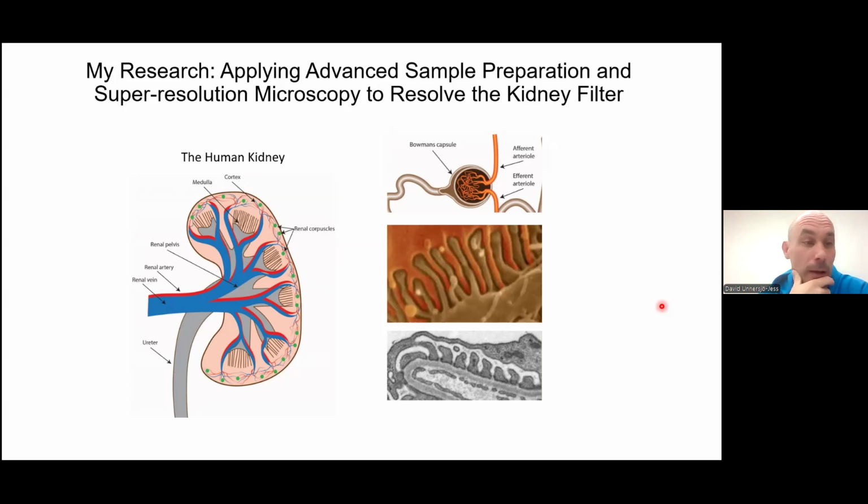Other than that, I can imagine that bone is very hard to expand if you don't treat it in some way, decalcify it or whatever you would do. But there are ways to deal with this issue for most types of tissue. You just have to use the right cocktail of enzymes to digest away these problematic parts of your tissue.